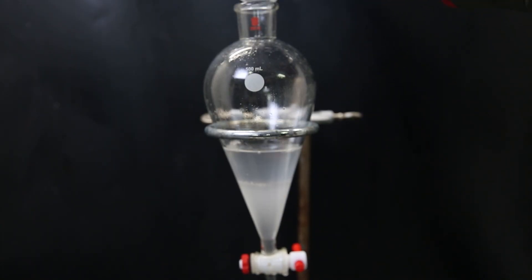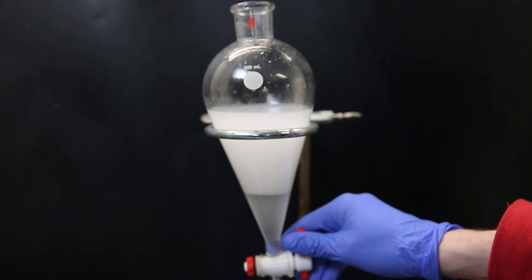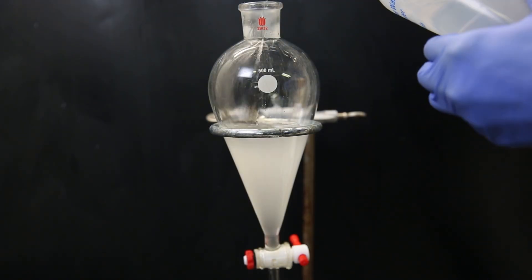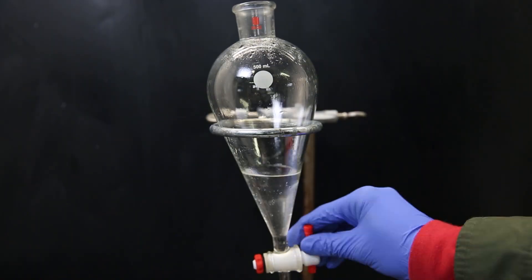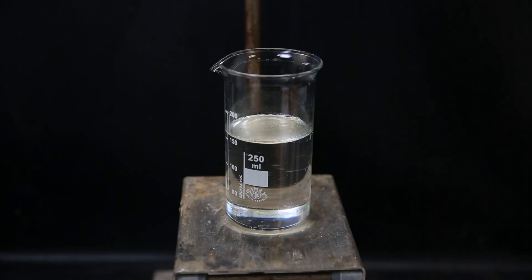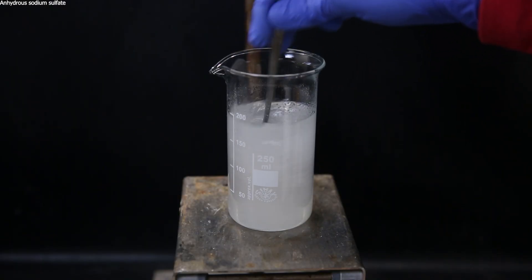On top of that I add the rest of the filtrate and again add some water to knock out any remaining product. I then return the product to the separatory funnel and wash it once with water and then once with brine, which we see takes out a lot of the cloudiness. Now I have collected all of the product in a beaker and add some anhydrous sodium sulfate to absorb remaining droplets of water.